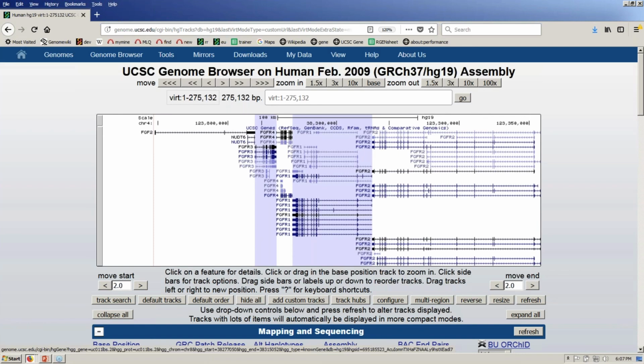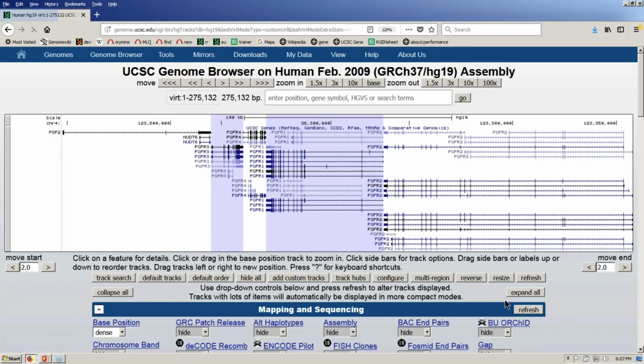And so you can see that our 5 genes here are in alternating white and blue background because we checked that box, that little highlight box on the multi-region interface. Here's something I showed yesterday that I can show now again. The resize button will let me take that graphic and expand it to fill the size of the window I have on my Firefox right here.